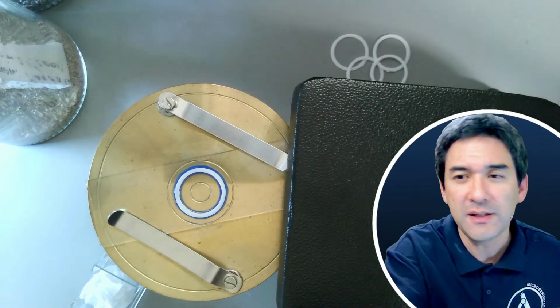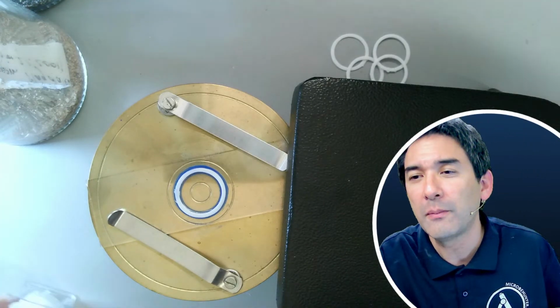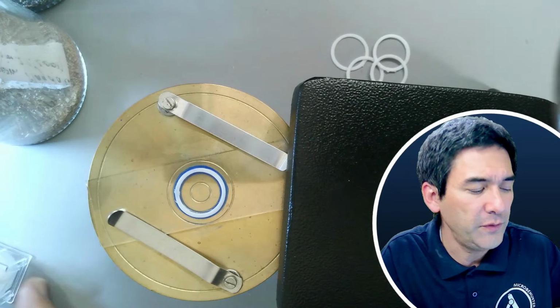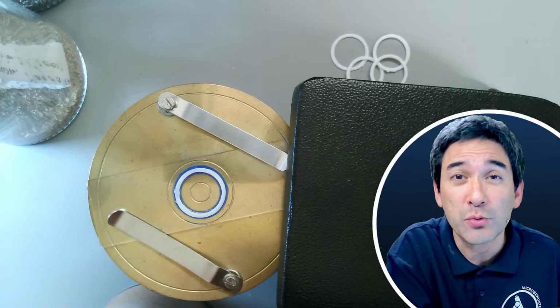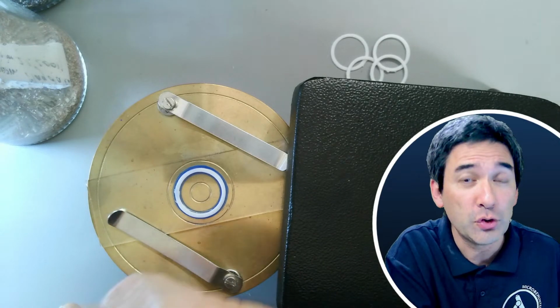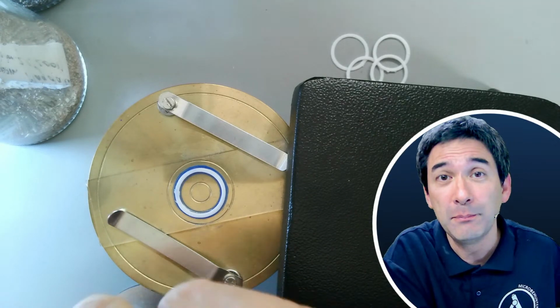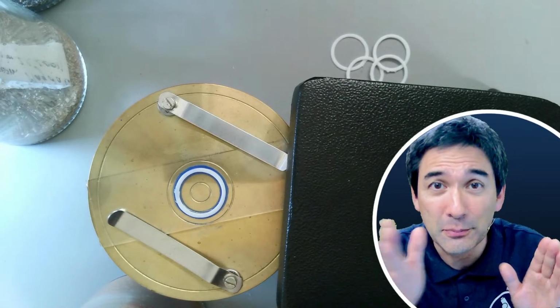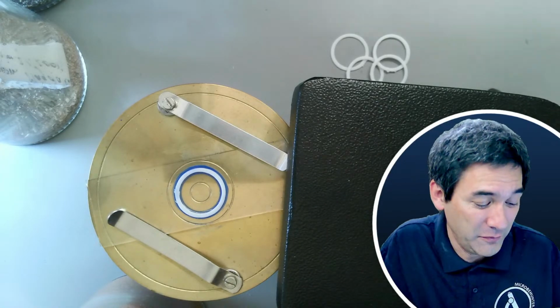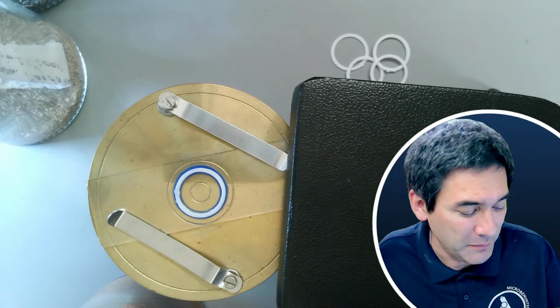Can you do chromatography through a microscope? Well, chromatography, like paper chromatography, requires a separation of substances and then observing it under the microscope. Never tried that, but simple chromatography should be possible, especially using the stereo microscope. Maybe you're able to separate some of the colors of a pen, for example, or of other pigments.